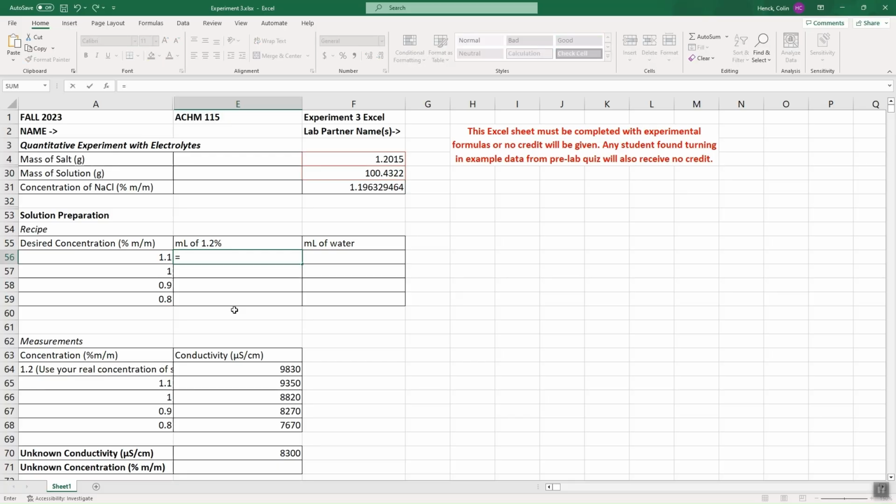So this is C1V1 equals C2V2. Specifically, it's C2 times V2, which is 20 milliliters, because we're trying to make 20 milliliters of solution, as I discussed before, divided by C1. So C2V2 over C1 gives me V1. How much of this do I want to use? It was 18.4 because we rounded before, and you can only really measure to 1 decimal place with a graduated cylinder. Now, how much water do you have to add?